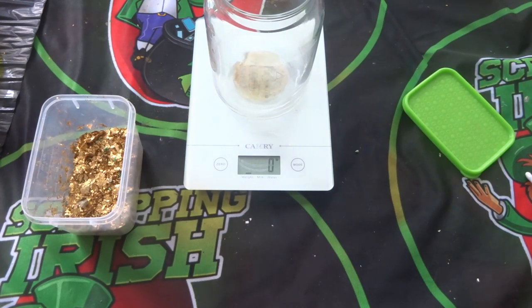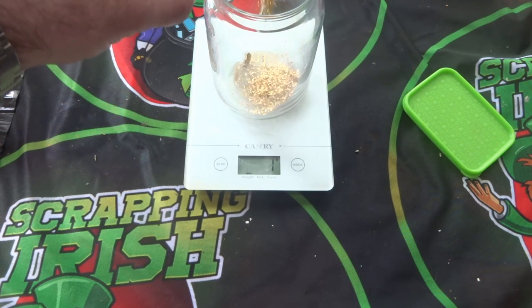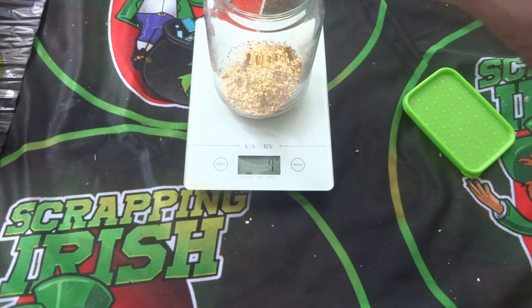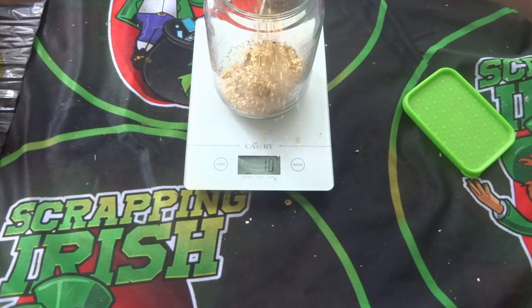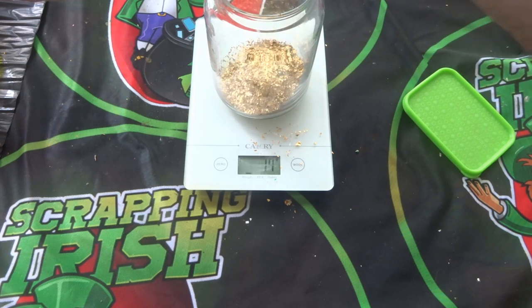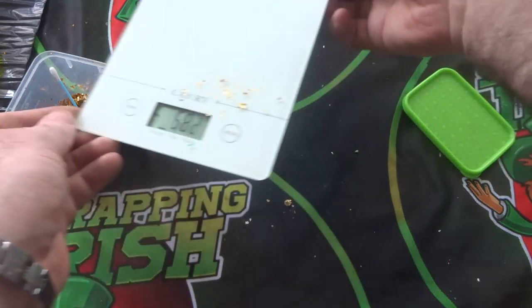I'll use one of these little Q-tips to spoon the foils out and knock them in. They're very light, so I'm being careful not to go too fast and lose any. I'm gathering them up afterwards — all these foils are very, very light.